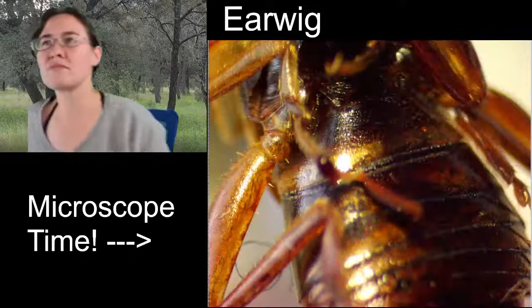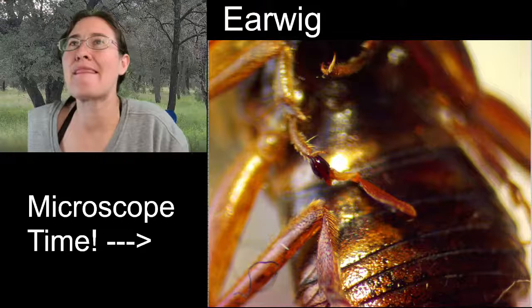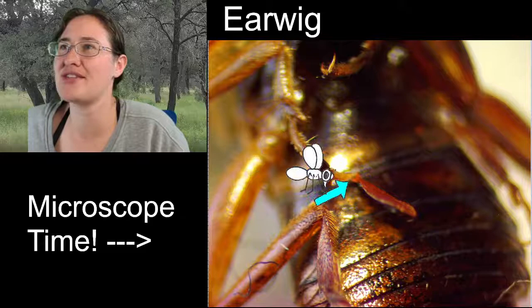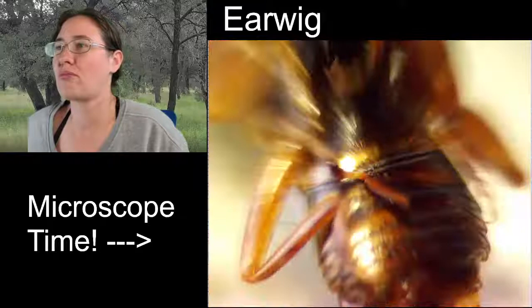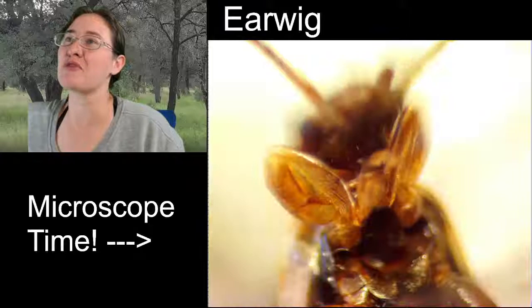Flipped over our specimen and I was looking at it. I don't know what it's holding on to. This is weird. I don't know what that is. This should have been the end of the tarsal segment here. Looking at earwigs from the bottom reminds me of cockroaches.